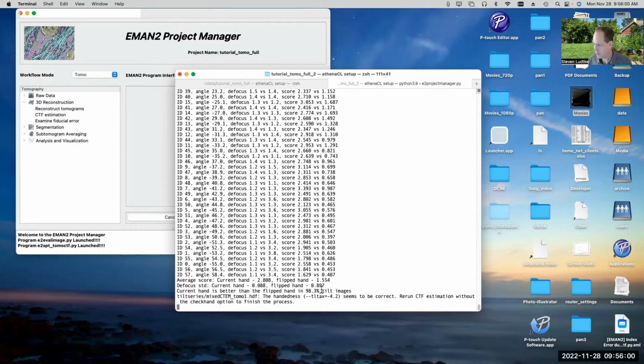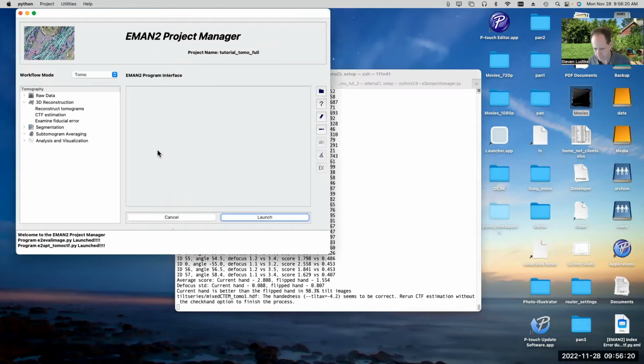So our assumption is that we're sort of targeting the average defocus, which should be in sort of the middle of the lamella in the center of the tilt image. That's kind of the value that we're targeting to have. And once we have that value, then we use that along with the known position in the 3D space for each of the particles. We'll talk a little bit more about that later.